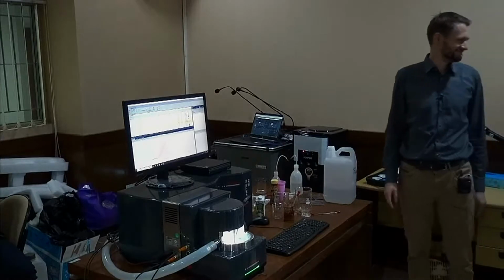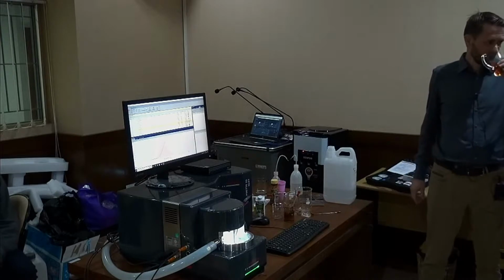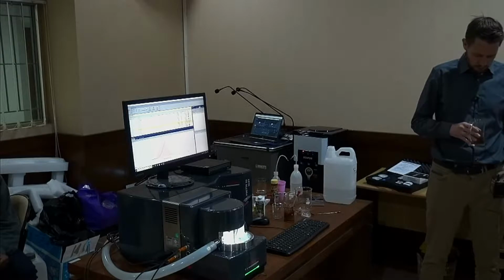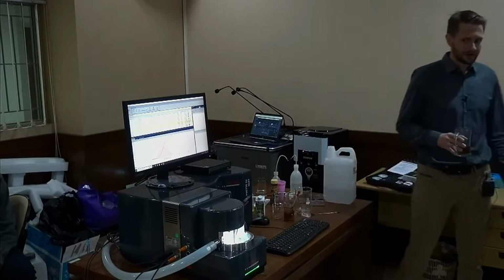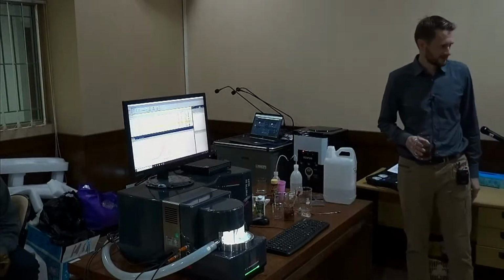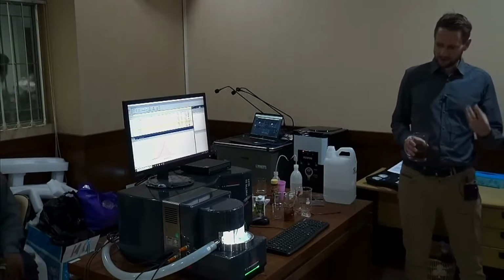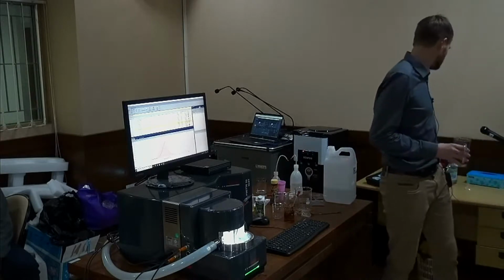I just have a question. I just wonder if I have another type of carbon, like maybe activated carbon or graphene oxide, is this liquid suitable, the one we used for carbon black? This one you mean, the surfactant. Actually, I would never use this, as I mentioned in the first place. I would start with sodium pyrophosphate. It's also a surfactant. It's not as strong and also will not create so many air bubbles. But usually, if it's also carbon, it will probably behave very similarly.